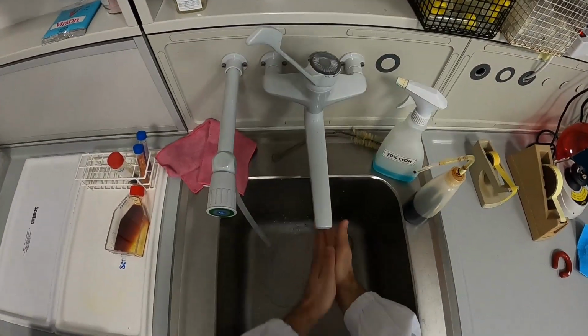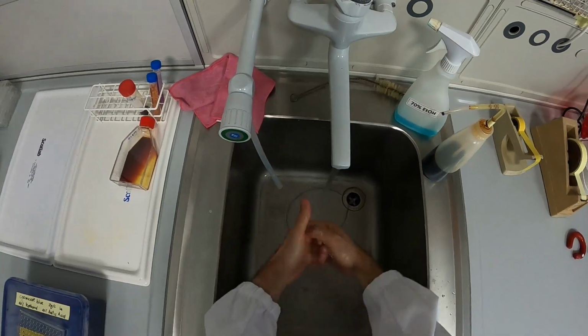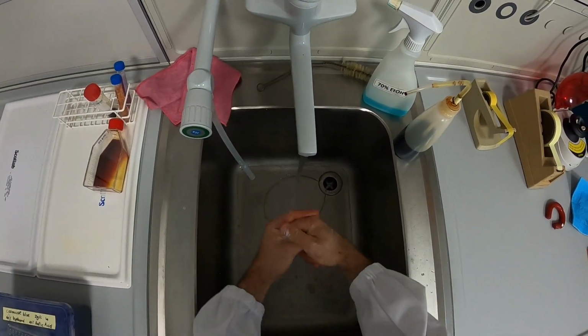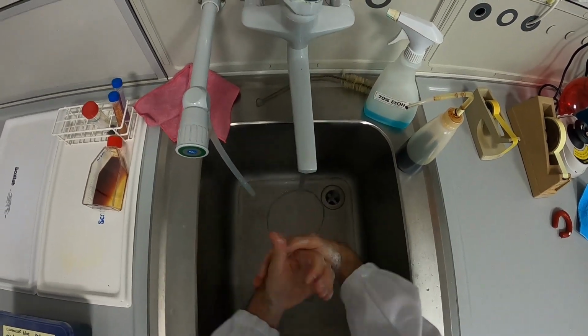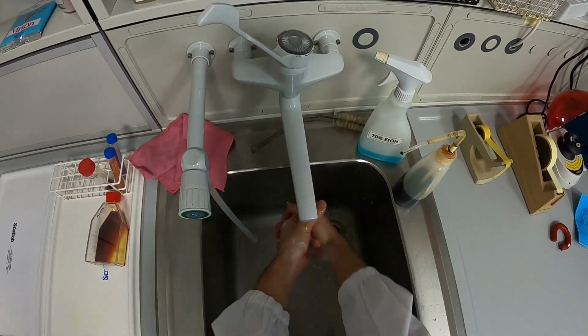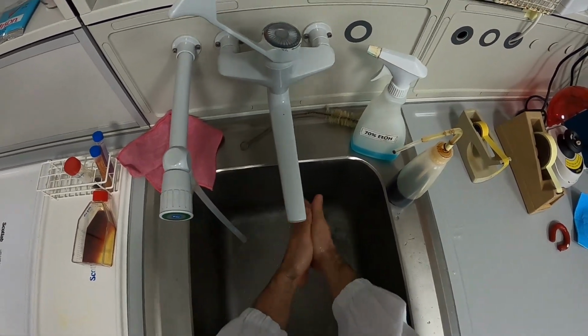We wash our hands. It is important to be as clean as possible, and I will explain later why. We will wear gloves, we'll use some ethanol as well, but clean hands is helping a lot.